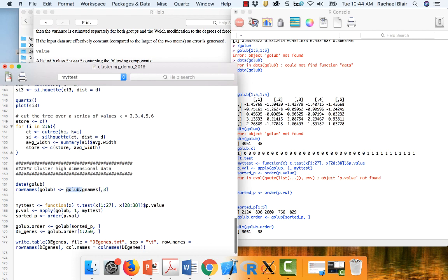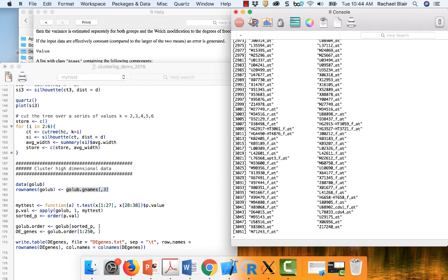Okay, so if I look at this, these are all the gene names. That's like what I said. They're not actually gene names. This underscore AT is specific to the platform that this was measured on, but these are all accession numbers, so you can actually use these and do a batch query to look at how these things map.